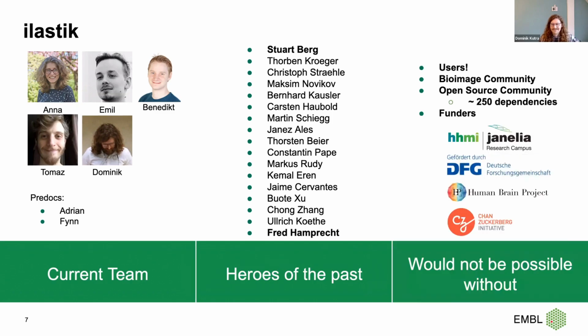And of course, we would not do this if we didn't have any users. So we interact quite happily with our users. Usually they find Ilastik very useful. And of course, they find ways to improve it as well. And for this, we are really happy for this feedback. We are happy to be in the bioimage community because it's such a nice one. Very cool people there, very friendly environment.